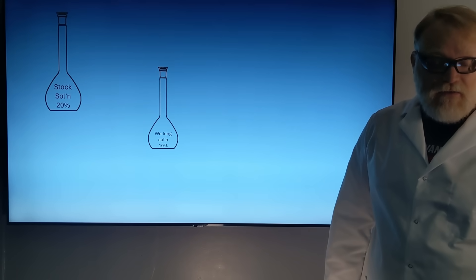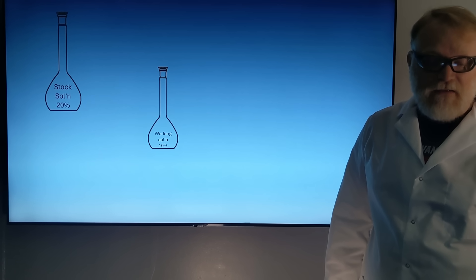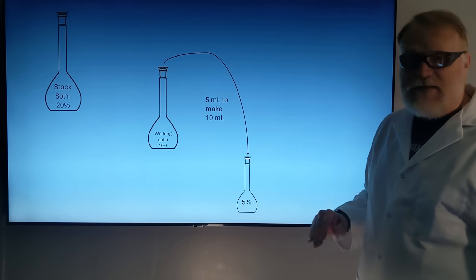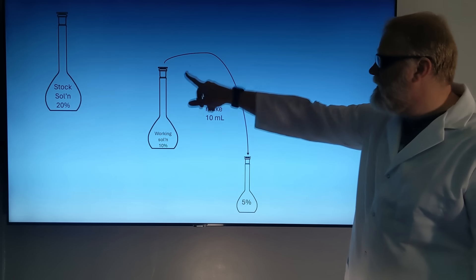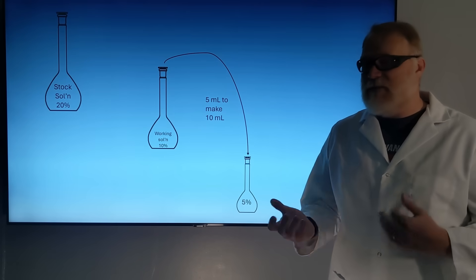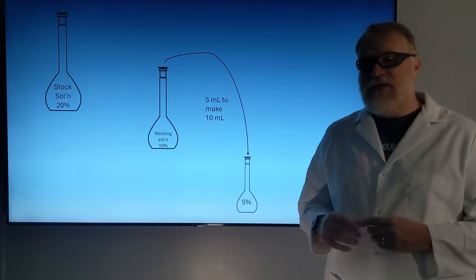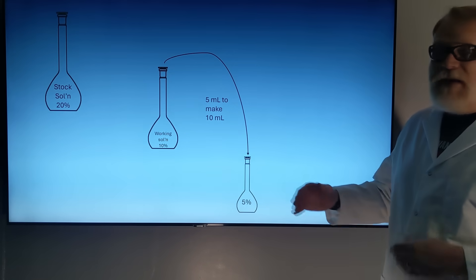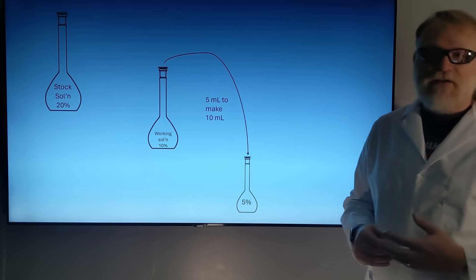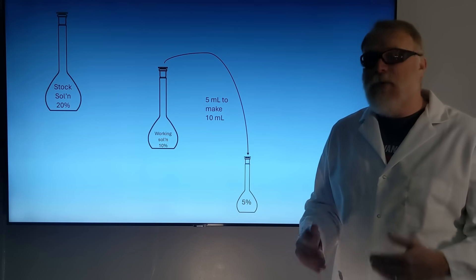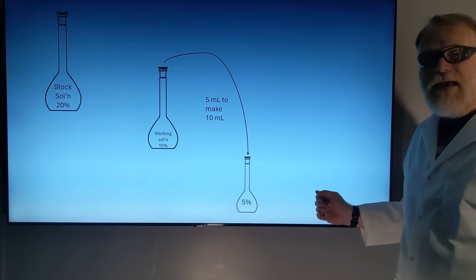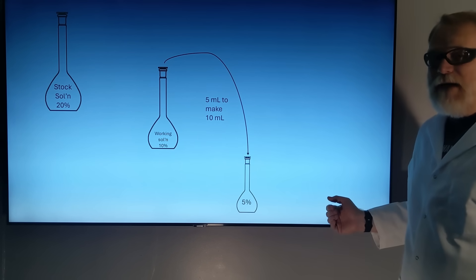Next we're going to make up some small standards, starting with a 5% solution. Using the same equation, it comes out to 5 milliliters of our working solution diluted to 10 milliliters, and we're going to inject that onto our GC. Now, from here we're not going to take from the 5% and put it into the next one down — that's called a serial dilution, and while it is valid, if I made a mistake, it will propagate that error into each subsequent standard.